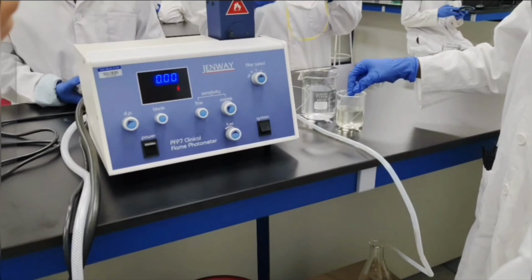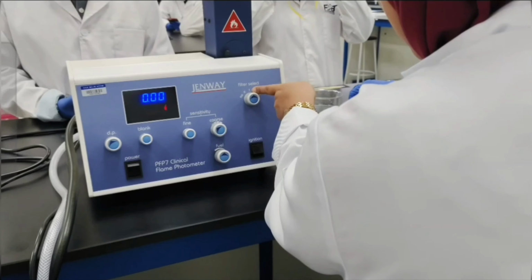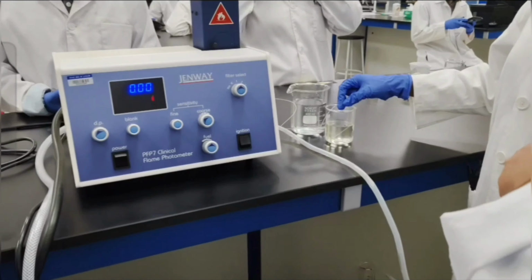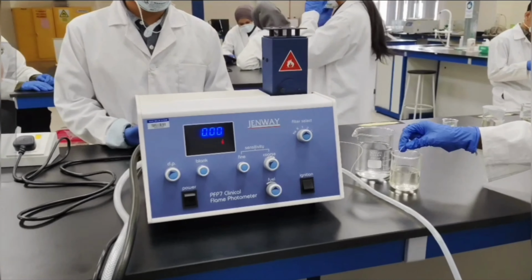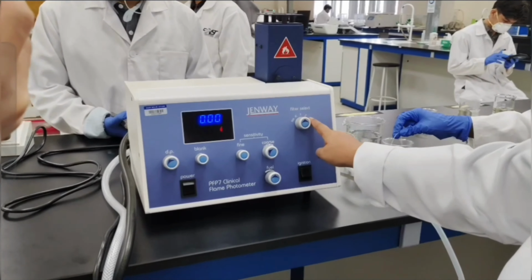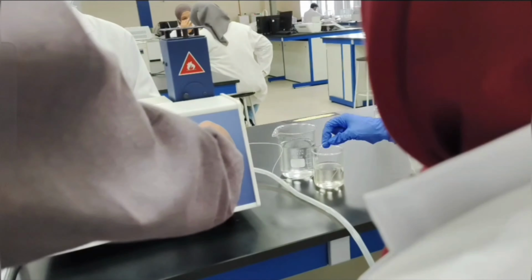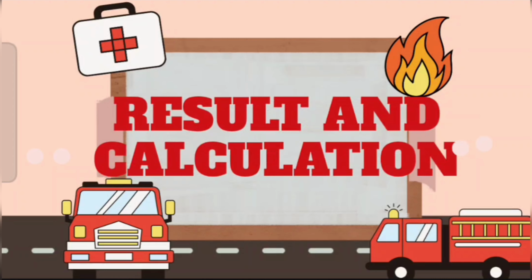Then we test for the concentration of natrium and potassium using the instrument, and the test is repeated 3 times each. And then the findings are recorded and tabulated in the table and the graph, for each concentration, to make a calibration graph for potassium and also natrium.